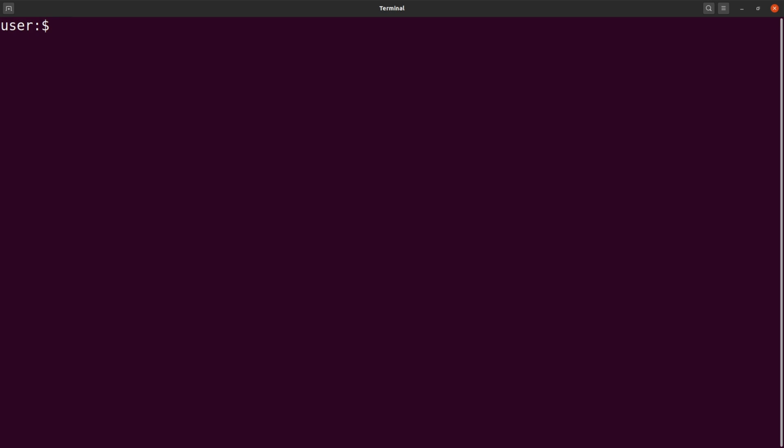The first thing to do is to install the software we need. I will use Anaconda to do this. Anaconda does a great job of installing tools, so that is why I like using it. So I will just proceed. I will need to add channels. So this is what I will do. I will say conda config add channels, and then I will specify the name of the channel. The first one we are adding is conda-forge, so I have it here.